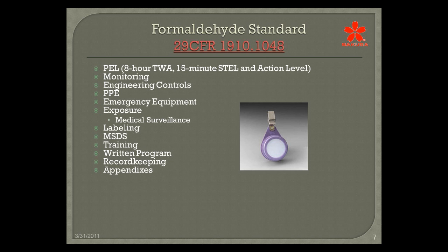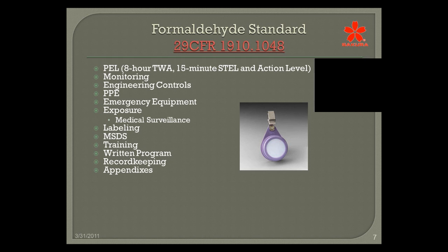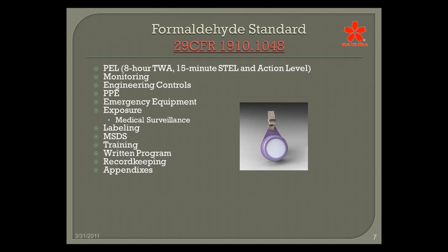We talked about engineering controls. So formaldehyde solutions. When I say formaldehyde solutions, that means 10% neutral buffered formalin, Bouin's solution. Anything that contains formaldehyde should always be used in a ventilated workspace, either a grossing hood or a chemical fume hood to control the vapors. If you have to use a respirator, that's the decision of your laboratory, but you need to make sure that you're below the permissible exposure limit. You may be above the action level, but again, there are some actions to be taken if you're at or above that level.